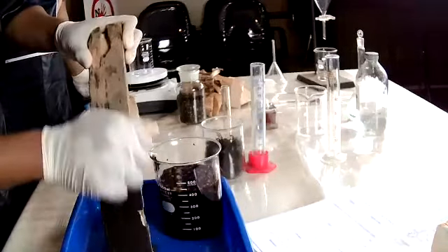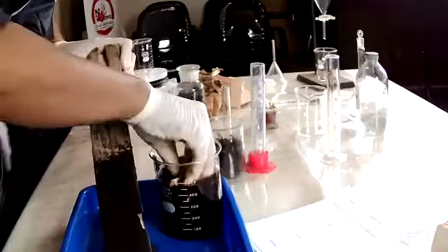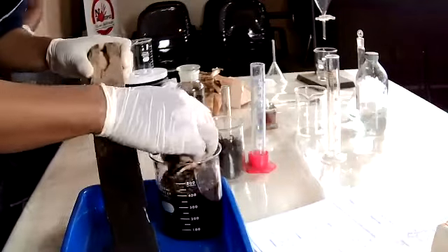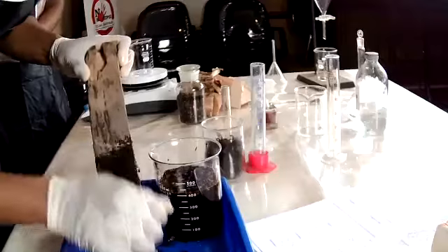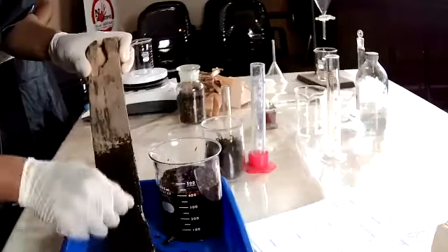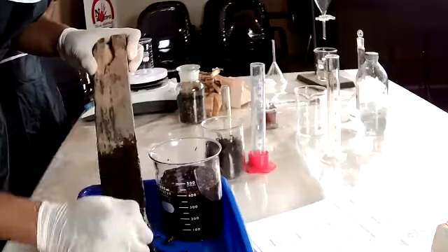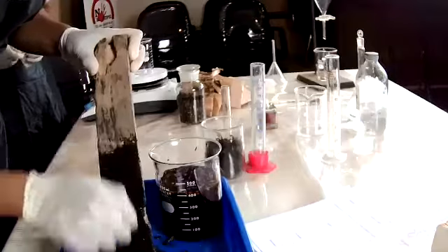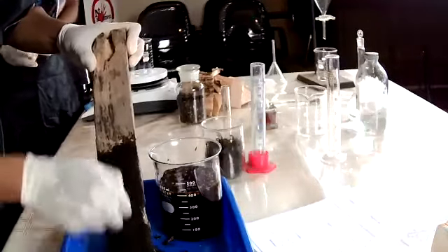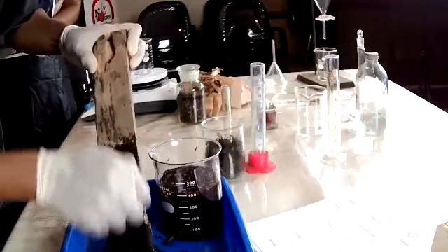You can be generous in terms of using the solution here so that the wood will be completely soaked. So lichens on maybe dirt and other stuff that is on the surface of this wood can be cleaned.